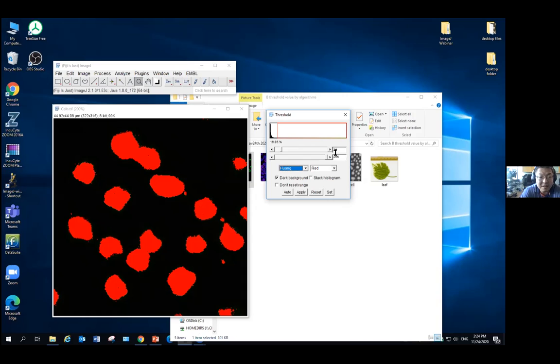In this case, someone may argue that you use a different value on different images, and supposedly it's not right. Yeah, it's not perfect. I would say it's not the ideal case. But in many cases, you have to do it this way. We'll show you in the next example, where you just cannot afford to use a single value on all the images.